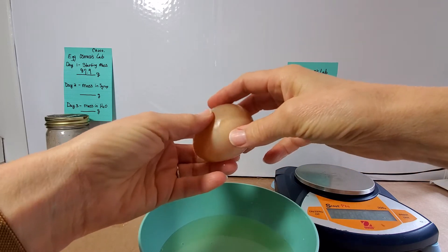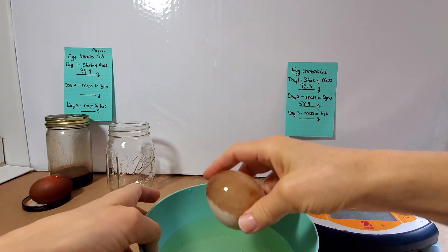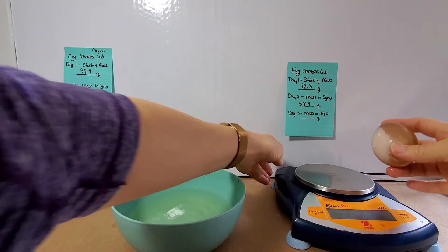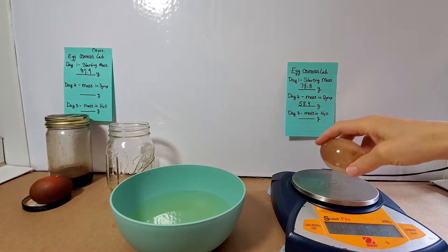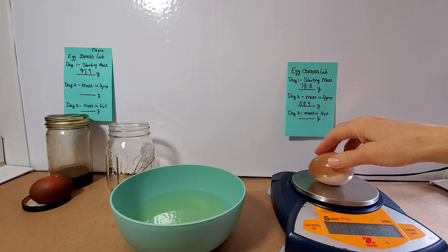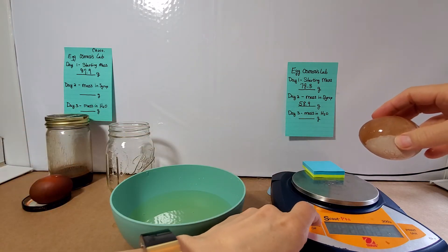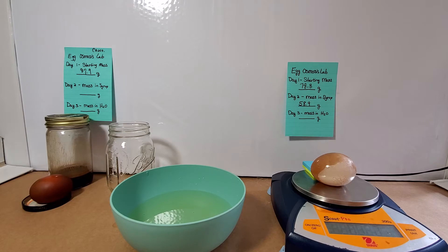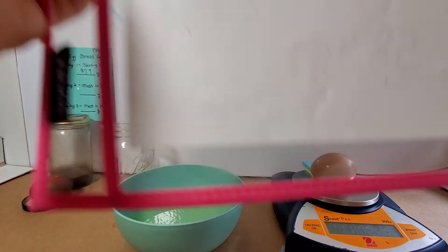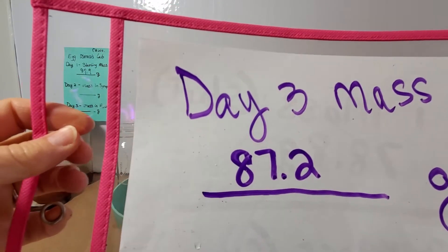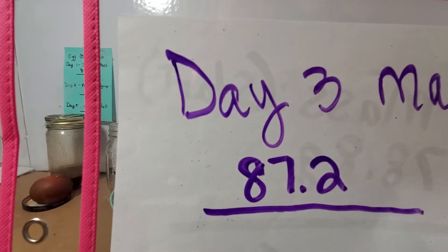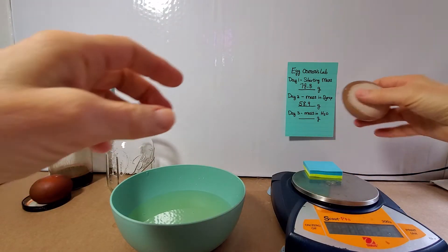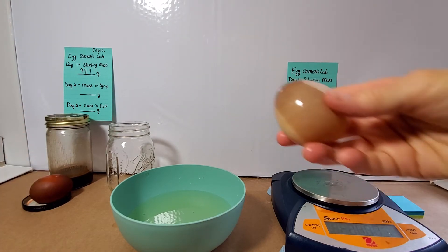It feels like something I could play with — don't, not yet, it will break. We're going to find the masses. I'm going to bring this up here and zero it out. The downside of having this nicely expanded egg is that he's very rolly. We've actually gained quite a bit of mass — we're now reading at 87.2 grams. So if you have your notebooks out: on day one we started with 78.8 grams. We've actually gained mass — 87.2 grams — that is more than a 20 gram increase after soaking it in water, even with the sugar that diffused out.